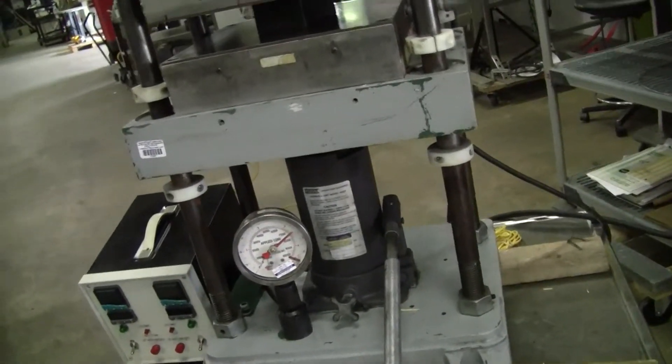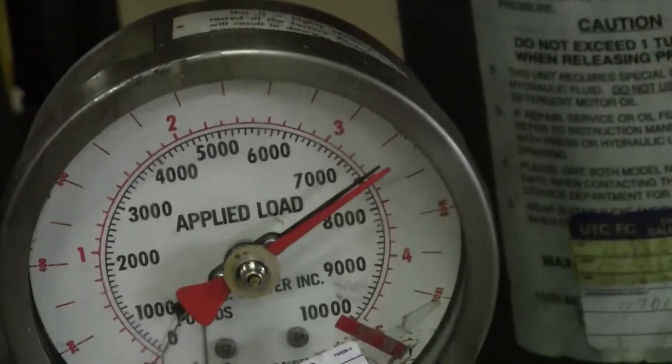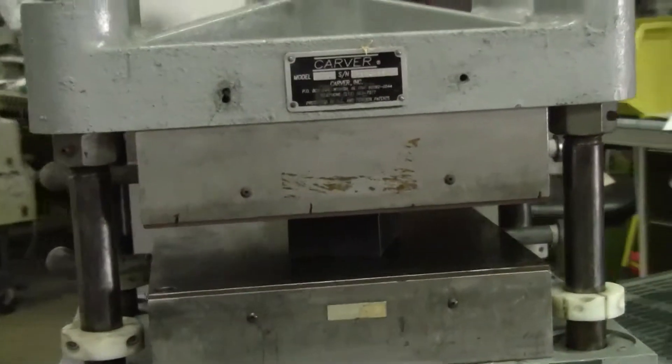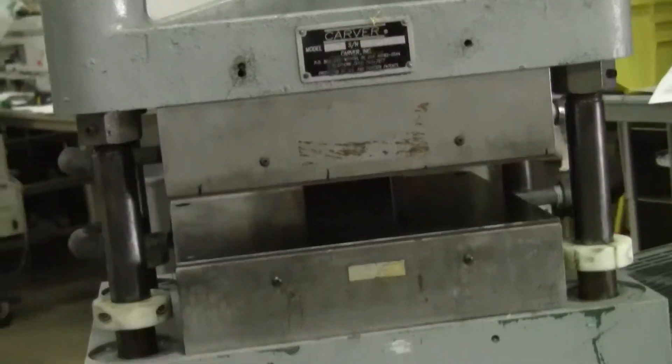We have it, it's been holding quite nicely for a few hours. There's our aluminum block, which is not included, but that's what it's pressing against inside.